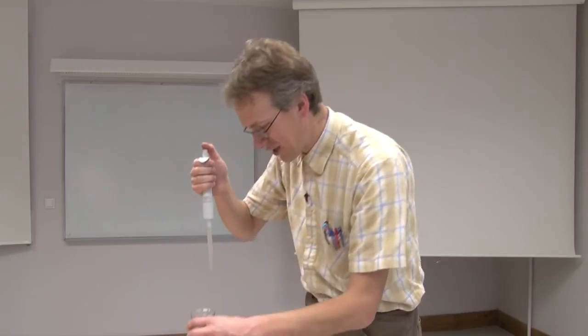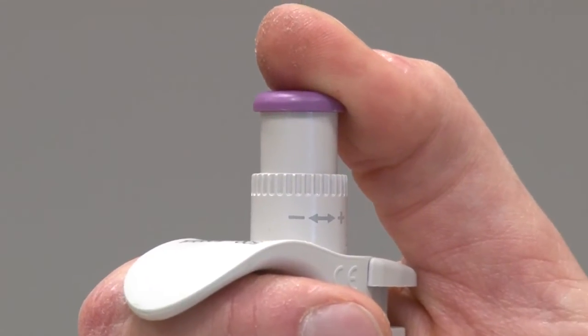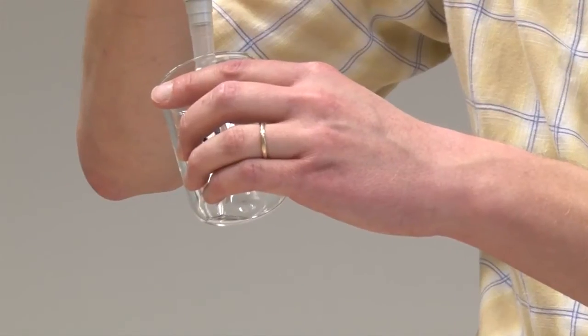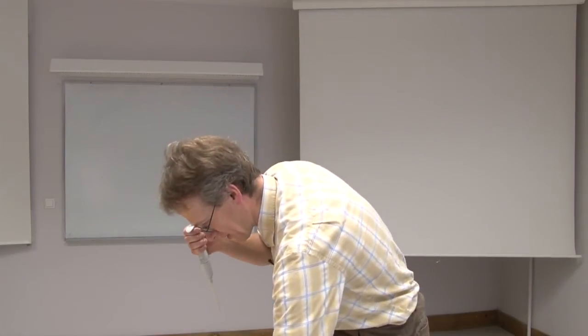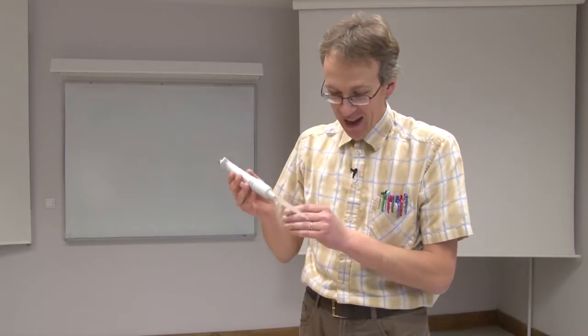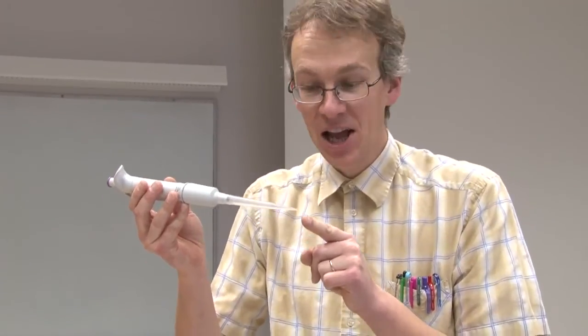Now that I've rinsed two times, I take the liquid a third time and deliver it into the sample beaker. I dispense completely and touch the top of the pipette tip to the liquid. This beaker should now contain exactly 2.3 milliliters of water. It is important that the pipette tip is completely clean of any liquid droplets, which means all the liquid has been dispensed into that beaker.